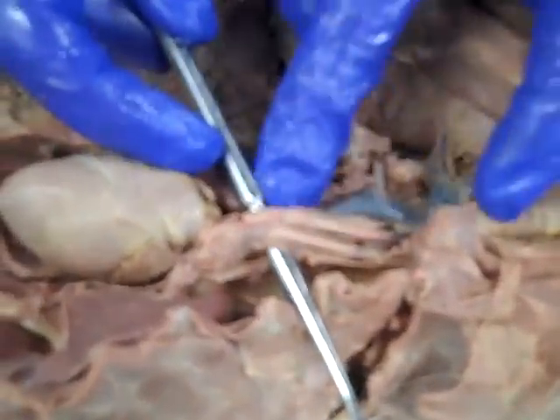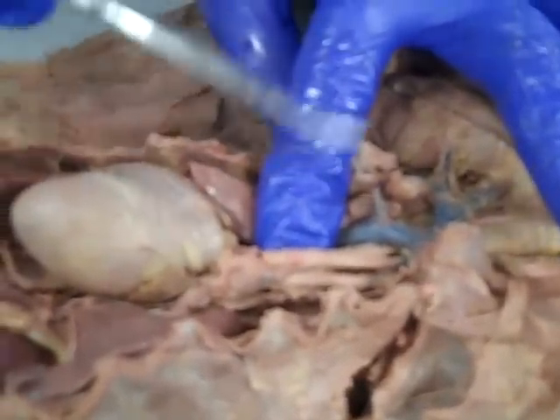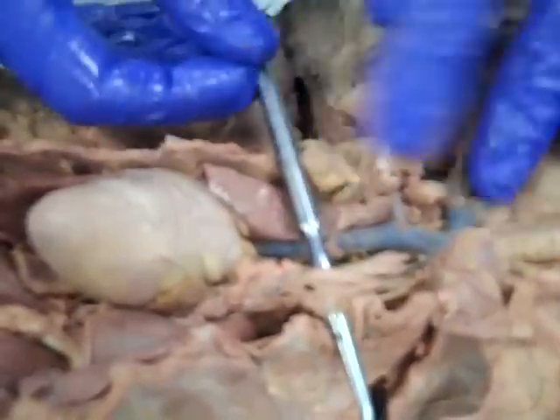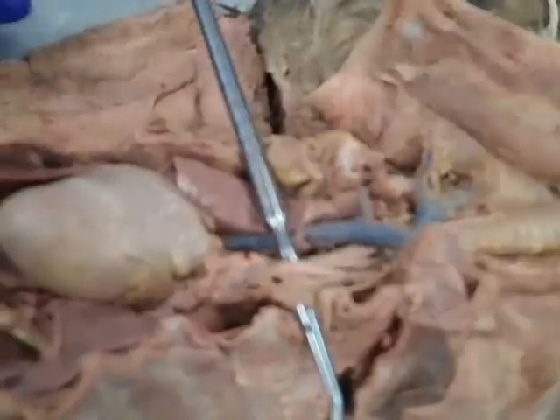So my two arteries are, in fact, my brachiocephalic artery, which is the first one, the one on the right, and then the left subclavian artery. The left subclavian artery is going to keep going up. As it goes up, it's going to give rise to the left axillary, brachial, radial, ulnar arteries as we keep going out towards the cat's paw on the left there.